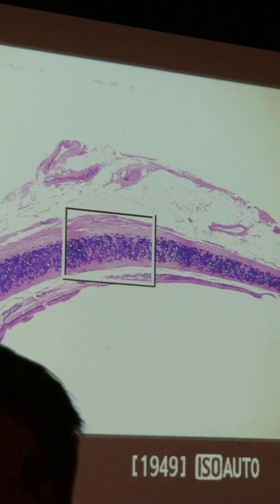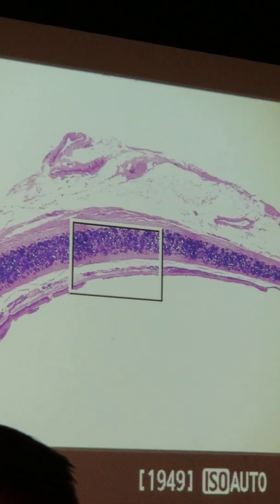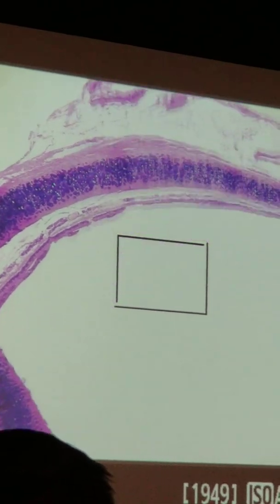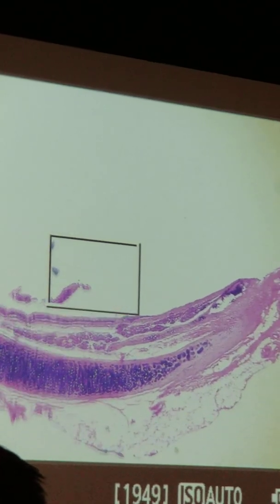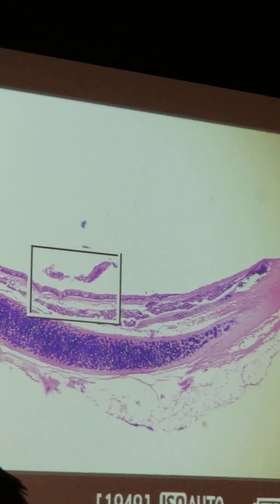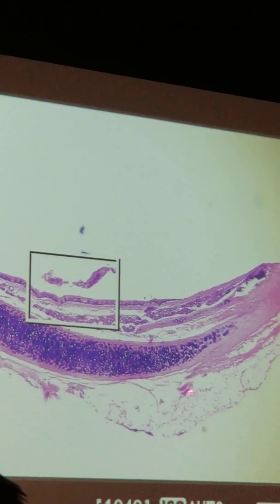And there's a couple different ways the slide's positioned. So now when you look at this, there's multiple different things in this slide. You guys, the stratified squamous is a darker strip right there. It goes down like that. So some of these you can follow it all the way down and it makes a bend like this. And so I kind of like to position this in like this, okay? So right there, only this strip, where my pointer is, is the stratified squamous. All this is connective tissue underneath. This is cartilage, which we're going to look at Tuesday night. There's some fat, adipose tissue down in here.